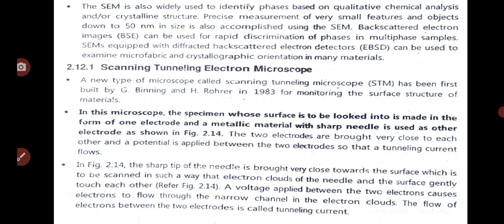The next method considered is the scanning tunneling microscope, that is STM. This is a new type of microscope called the scanning tunneling microscope, which was first built by G. Binnig and H. Rohrer in 1983 for monitoring the surface structure of materials.